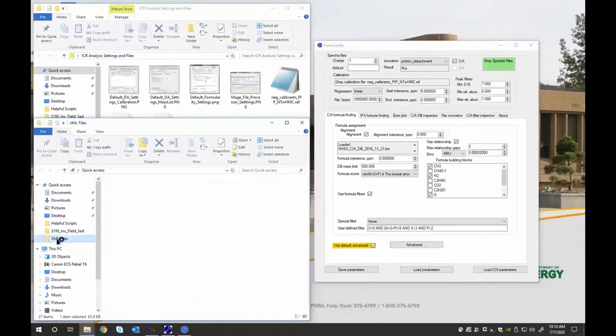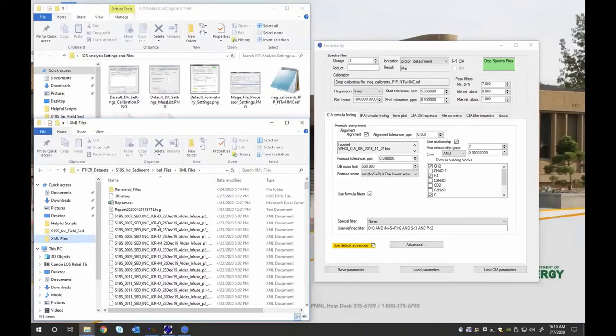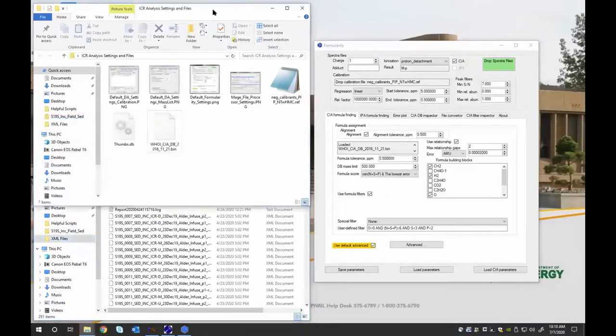Yes. Bob, you have another question about the calibration reference. Is it one calibration reference file for any sample, or does it depend on the targets? Ooh, yeah. So that's a very good question. So currently, Wonders uses a default calibration reference that was provided by Nikola. It's a broad target calibration list.